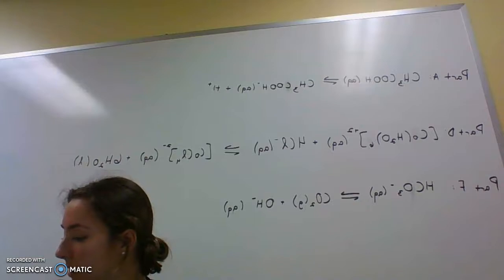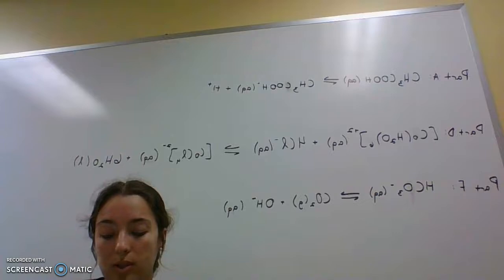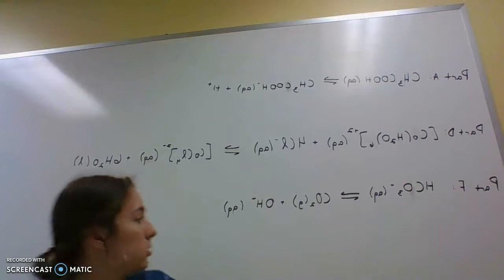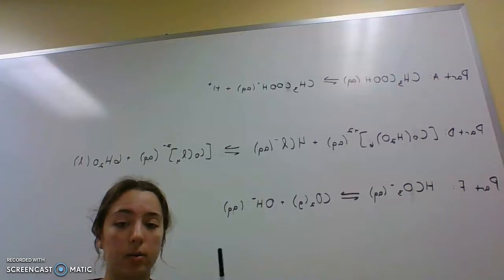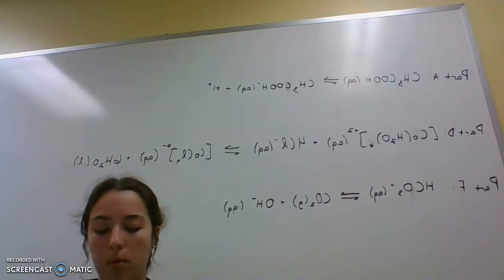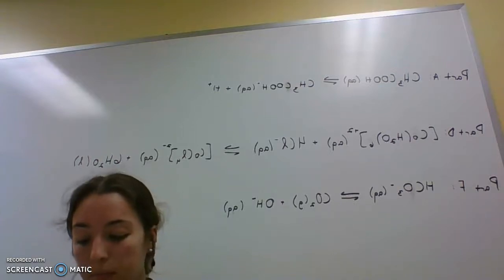So the first part was explain the chemical species that was removed by aspiration. The stress that was being applied to this solution was attaching the vacuum aspirator, which removed the gas in the solution. In this particular reaction, the gas was CO2. Because the gas was removed, we observed the original solution, which was a yellow-greenish color, and it started to bubble once we added that aspirator. And this was because the gas was being removed from the solution.